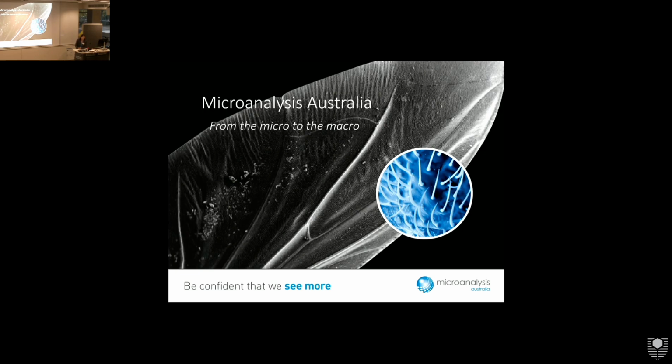We get a lot of stuff through where people say, "Oh, nobody else wanted to touch this," and we're like, "Yes, okay." It's got lead in it. It's got rare earth elements. It's got all sorts of stuff that's going to mess up other people's machines. Can you please have a look? And we're like, "Yeah, I guess we can stick it in the SEM. It's fine." A lot of the larger companies have set standard operating procedures, and their instruments are set up for very specific types of samples. So we get all of the stuff that they don't want, which makes for a more interesting workplace, I think.